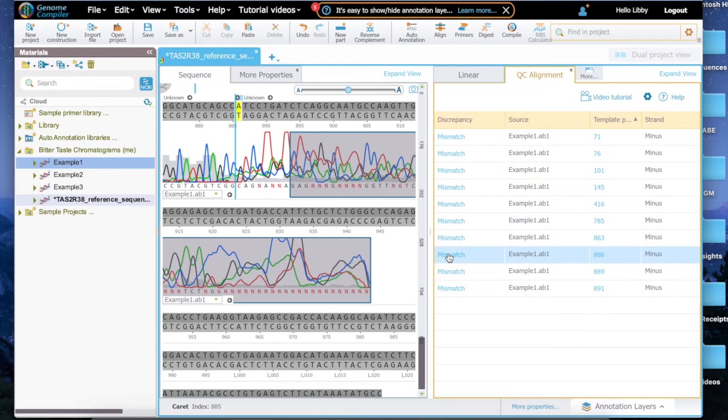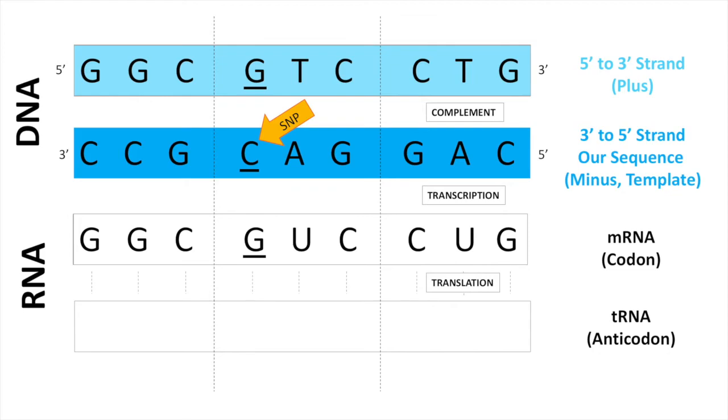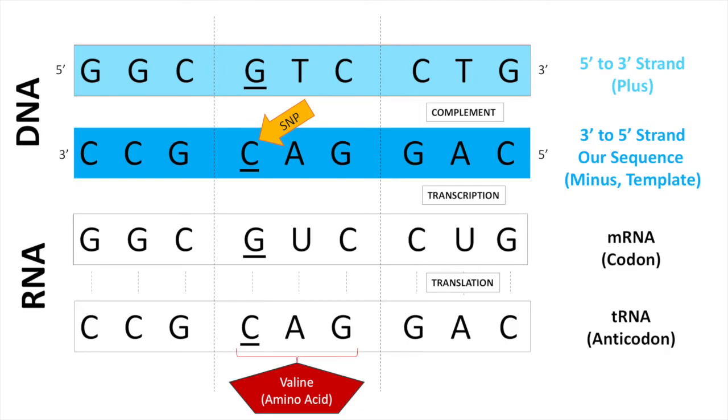When we scroll to that location, we can see that the location, C, is red. Genome Compiler has noticed the example sequence doesn't match the reference sequence. Using the same process as before, we can determine which amino acid corresponds to this SNP.